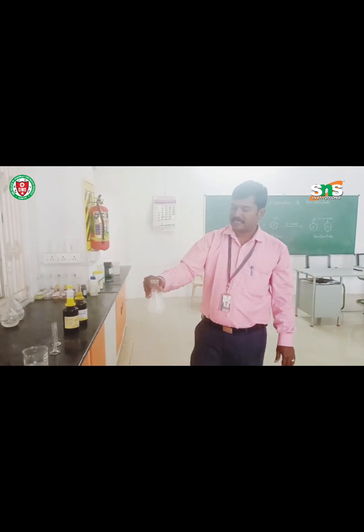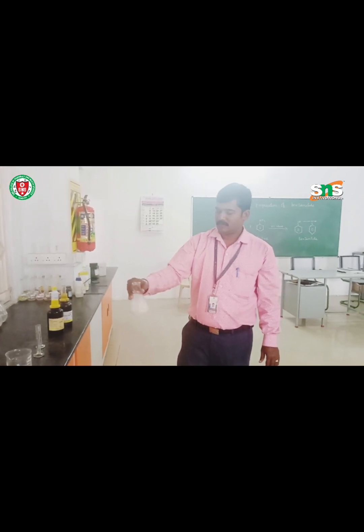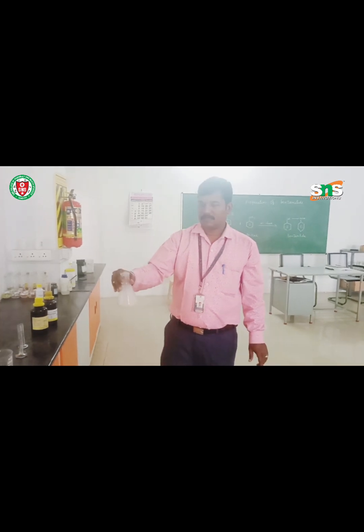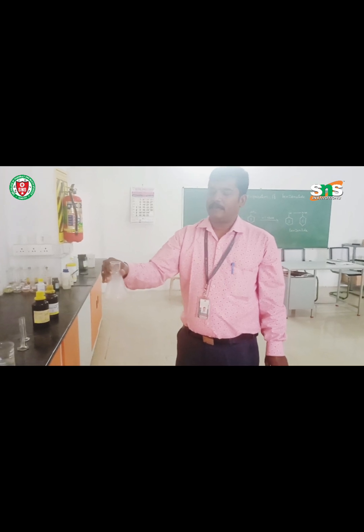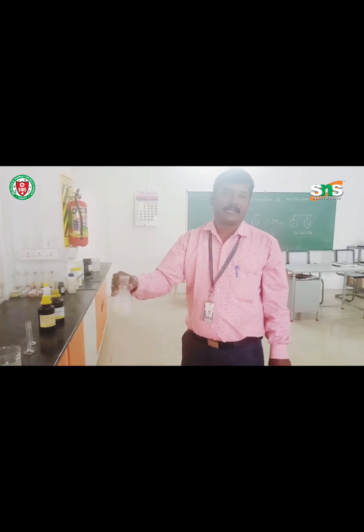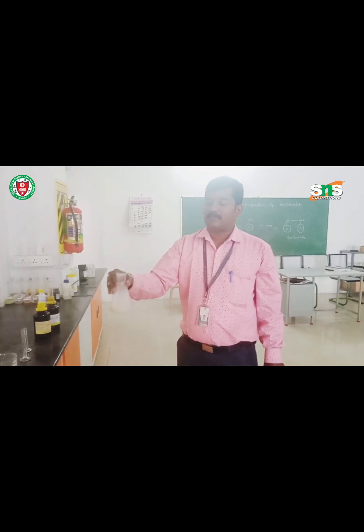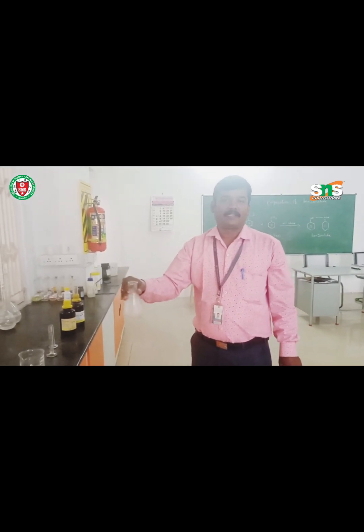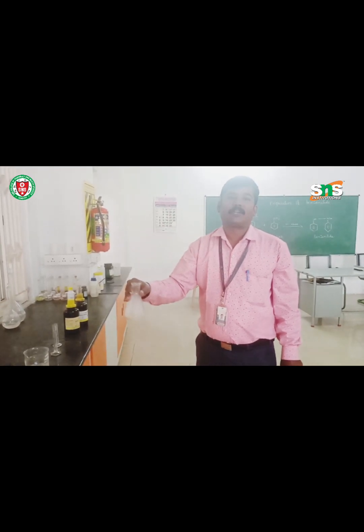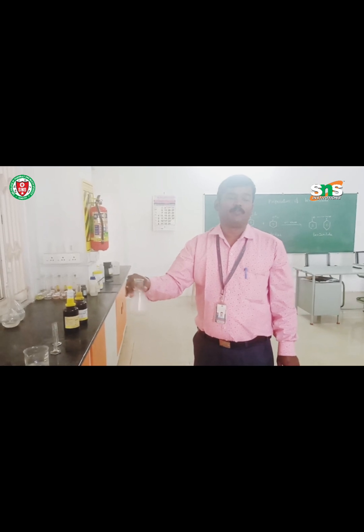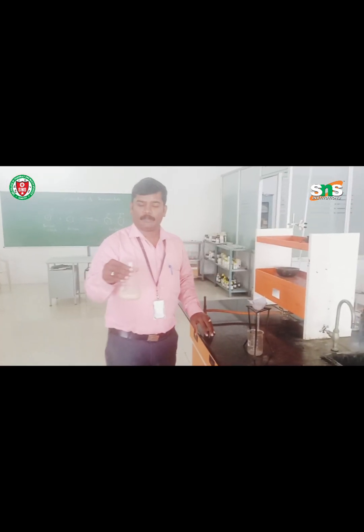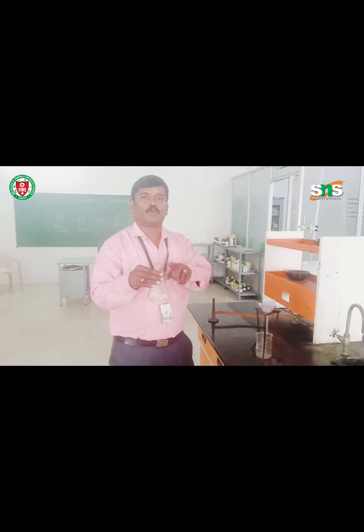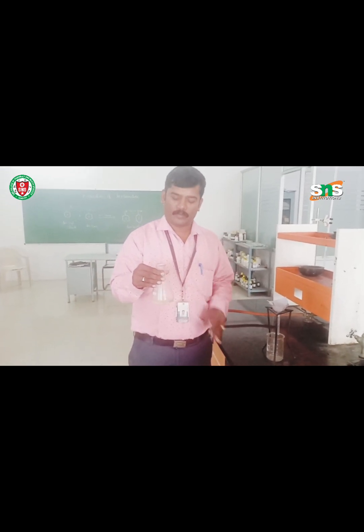You have to mix it well. After adding this benzoyl chloride, you will get the product benzanilide. Mix it well. Some fumes will come, so wait. Until no odor of benzoyl chloride is detected, you have to mix it well. The mixing is almost over. There is no odor of benzoyl chloride — we have almost synthesized benzanilide.